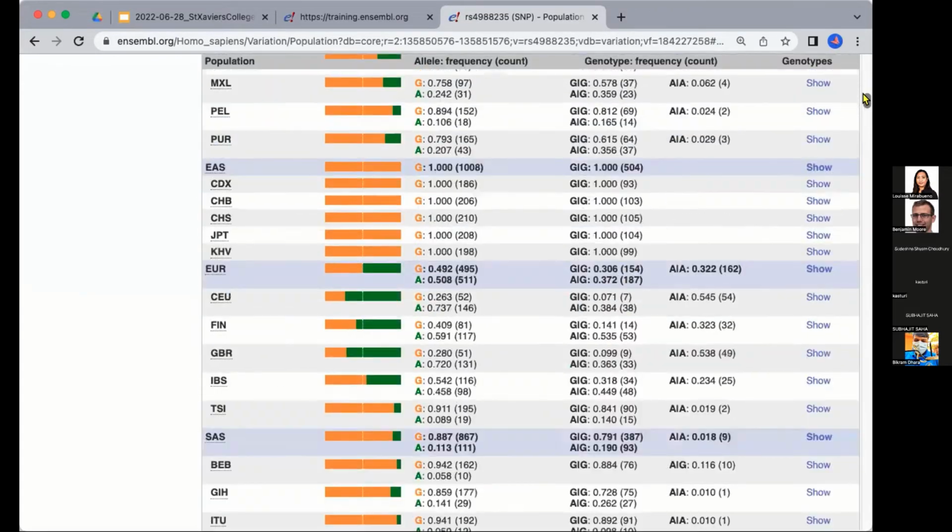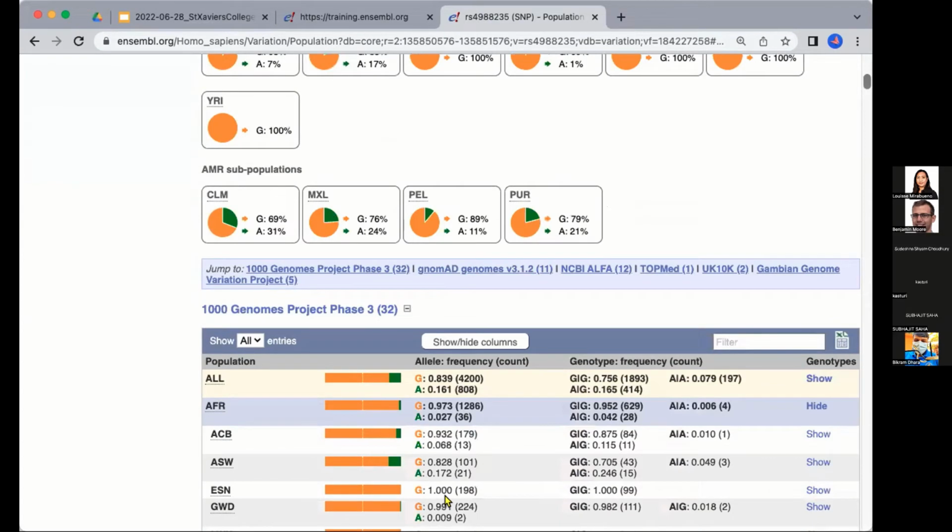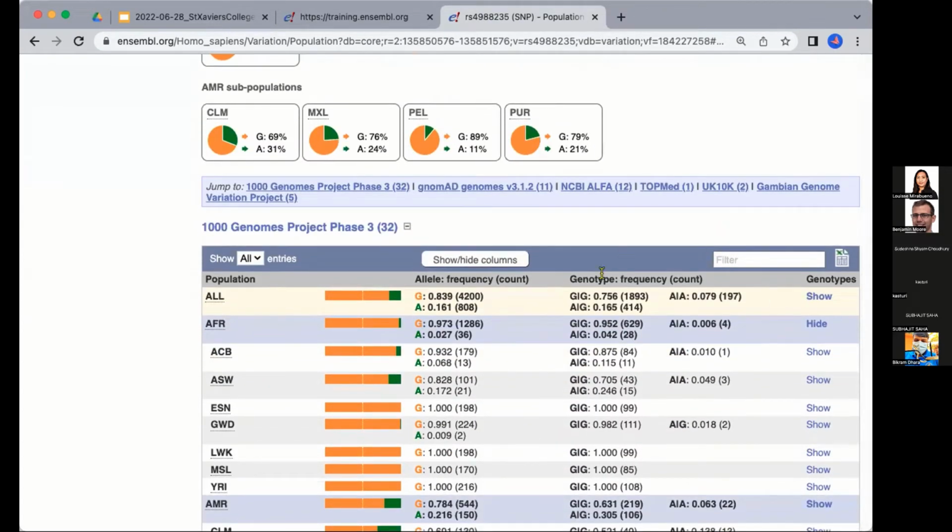Scroll back to the top. Oops, that was a bit far. If you want, you can also export this table. So again, there is an Excel icon on the right, and then you can select which table you want to download. So whether you want to download the entire table or whether you applied a filter and just want to download whatever the filter is applied to.